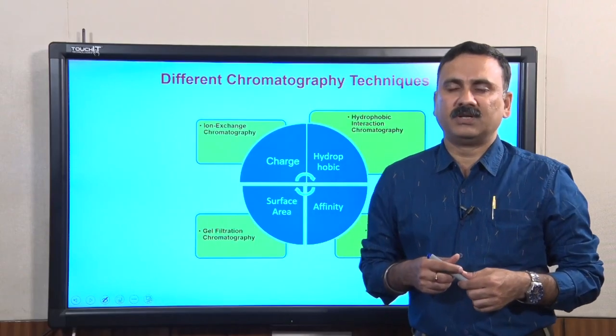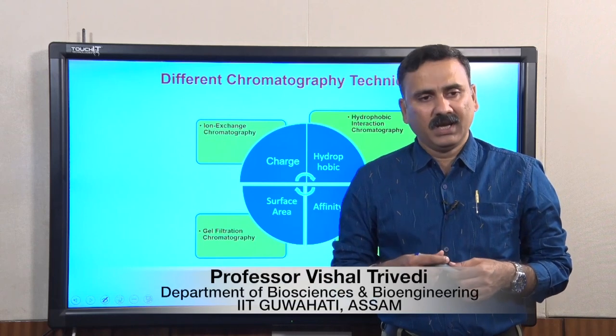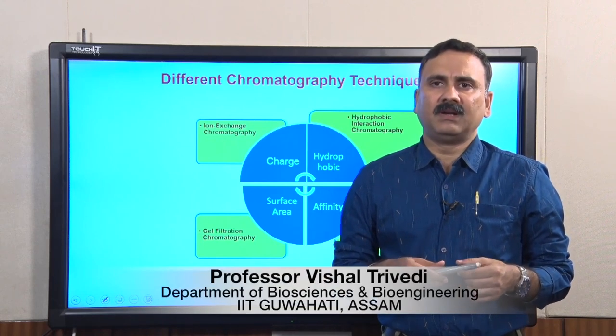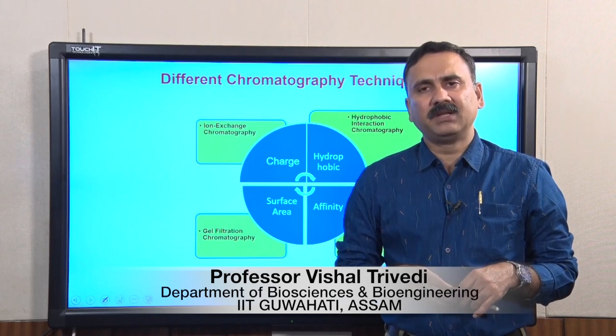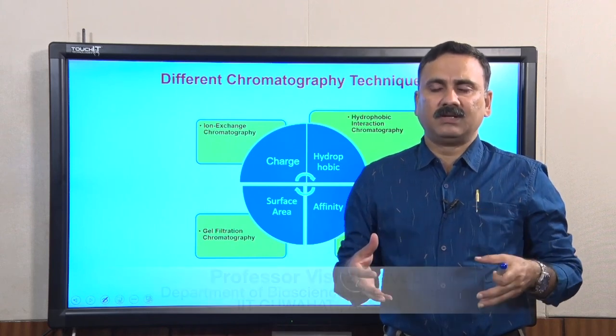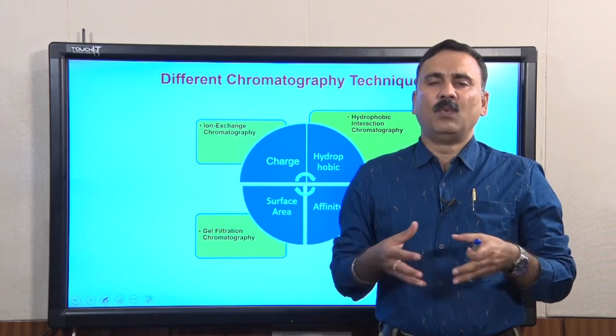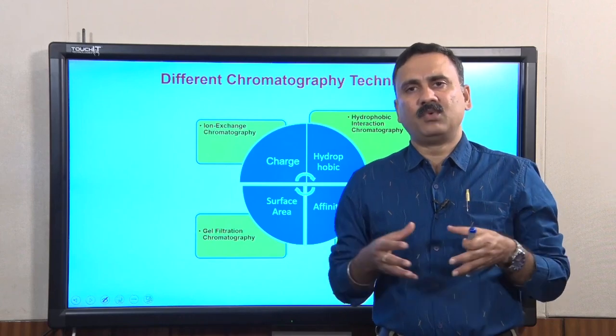Hello everybody, this is Dr. Vishal Trivedi from the Department of Bioscience and Bioengineering, IIT Guwahati, and what we were discussing about the different chromatography techniques which people are using to purify the protein or the other factors from the cells where they are overexpressing these components.